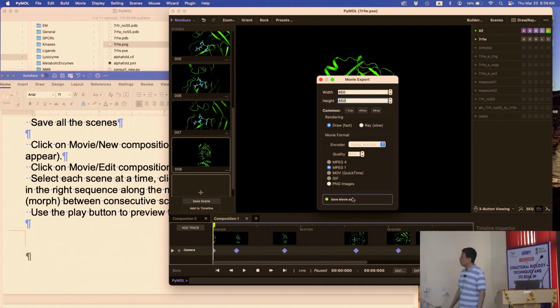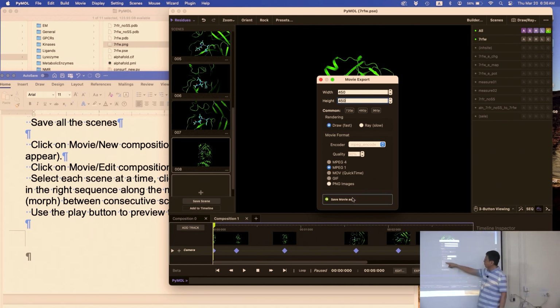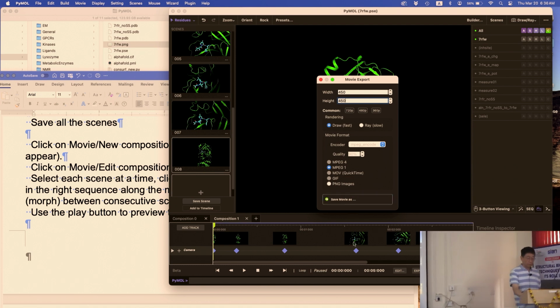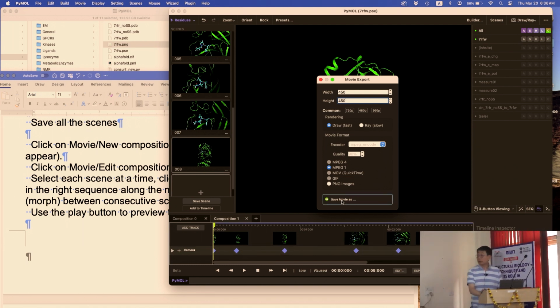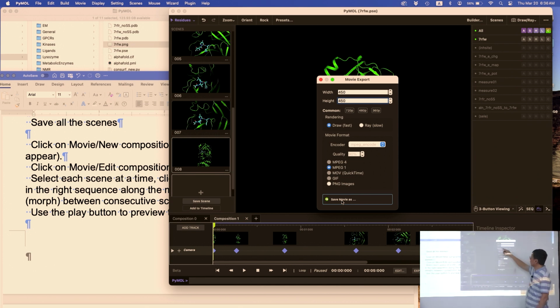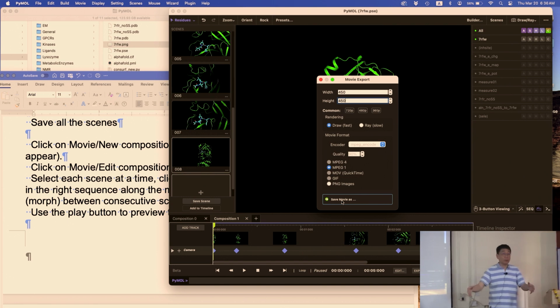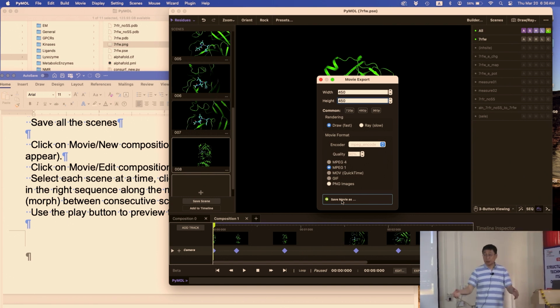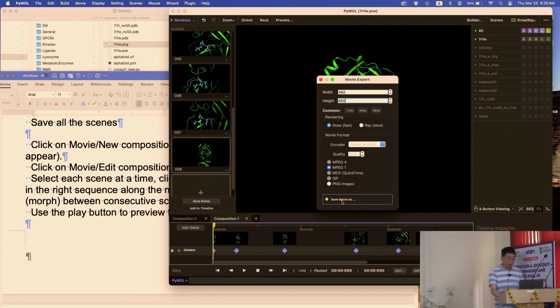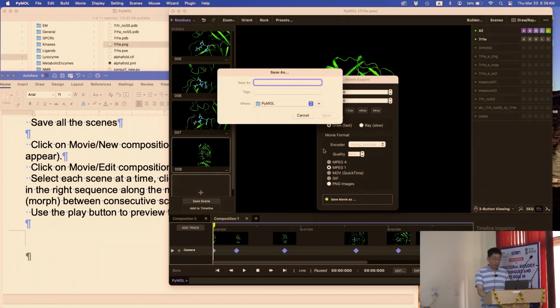And draw fast, MPEG-1 encoding, and then you click on Save Movie As. Okay? Click on that. Got it? So, yeah, 450, 450. That's what I showed up there as well. This makes the movie smaller, because otherwise you make a humongous movie, you put it into your PowerPoint file and it will be 200 megabytes. Can't do anything with it. Okay? So Save Movie As, and then you give a file name, so 7RFW.